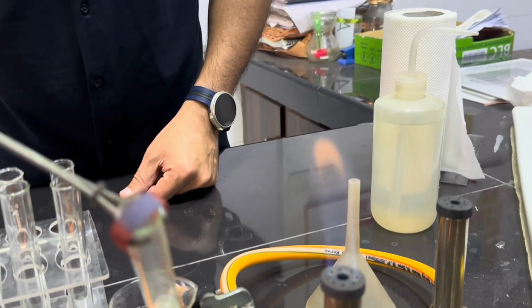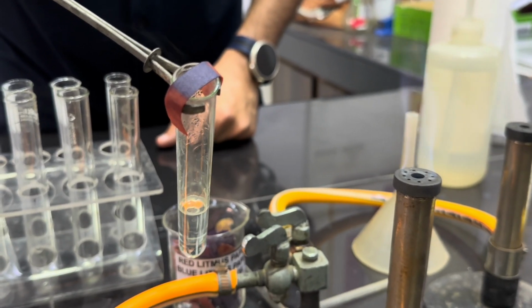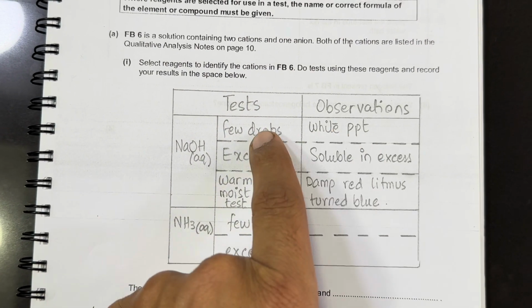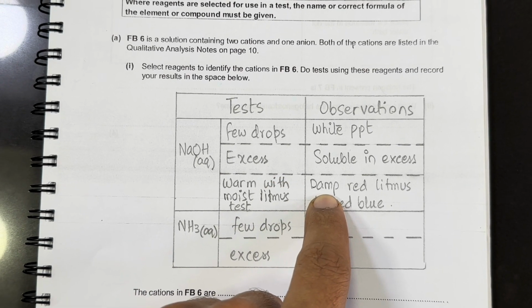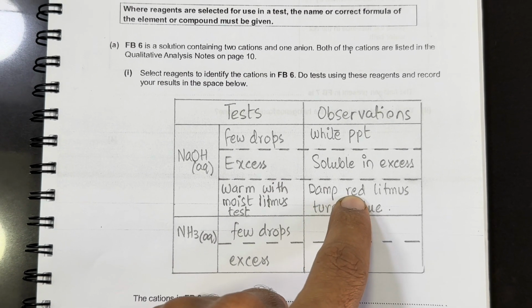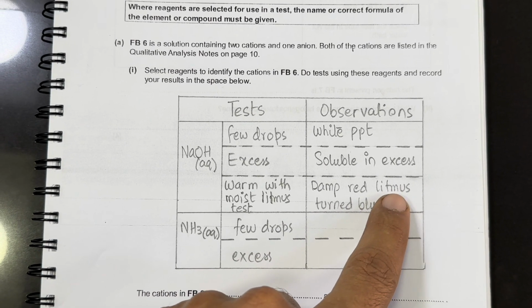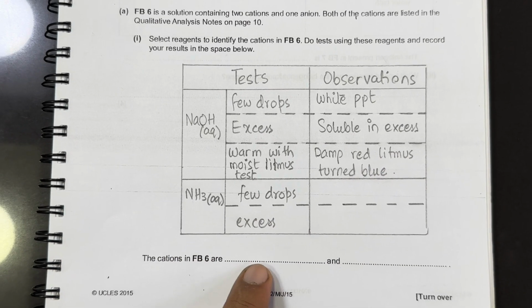It means the test is positive for ammonium ion also. So we have recorded the observation: white precipitates formed with a few drops, which were soluble in excess, and warming this resulted in damp red litmus paper turning blue. This means ammonium ion is present. So one of the cations is confirmed from here, that is ammonium.